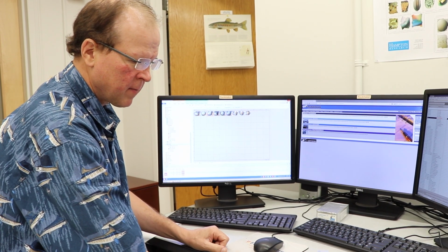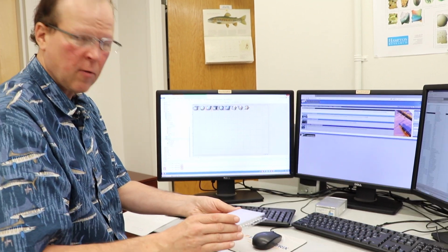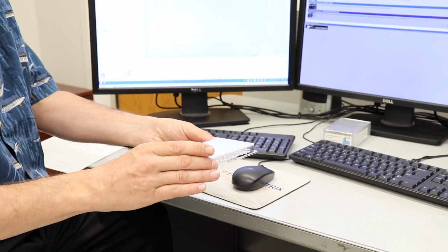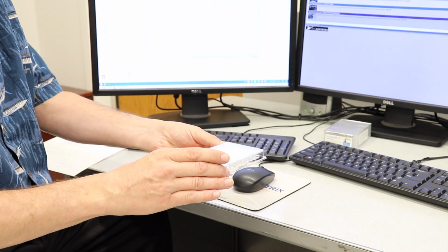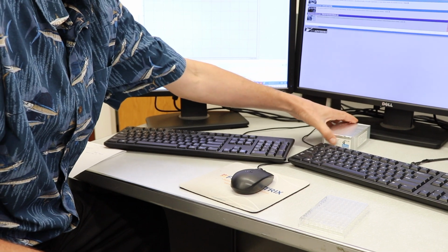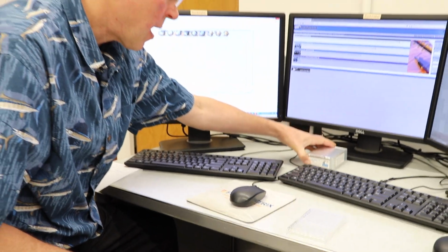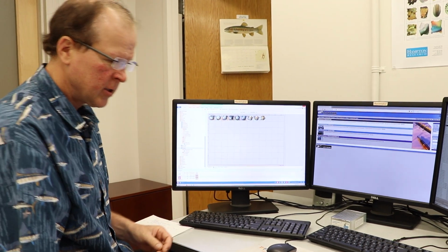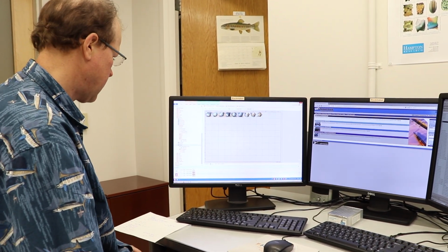Okay, in this segment, we've set up a 96 well experiment on hanging drop with a single drop per well using the Formulatrix MTA, using the commercially available screen from Hampton Research. And I'm going to show you how to set up RockImager to have it automatically image.